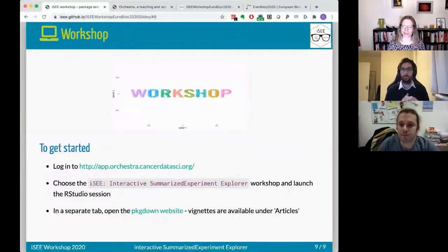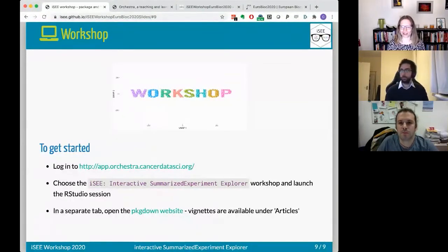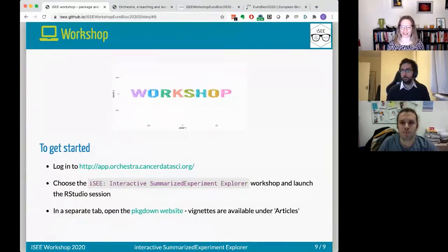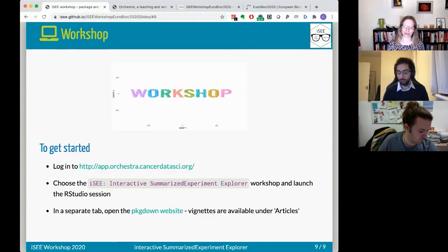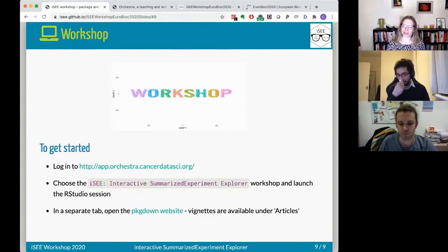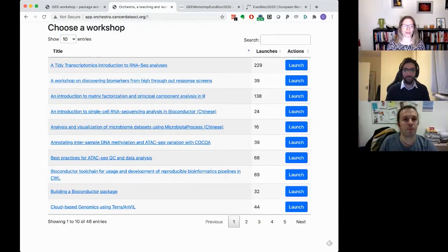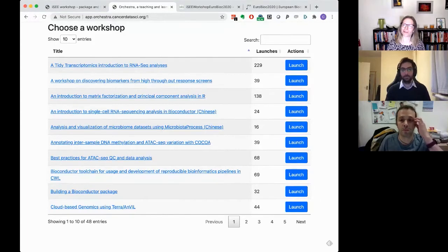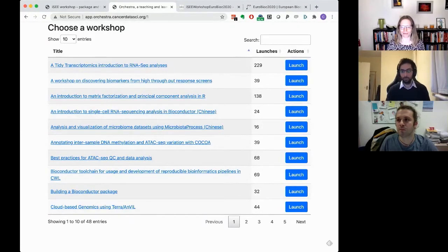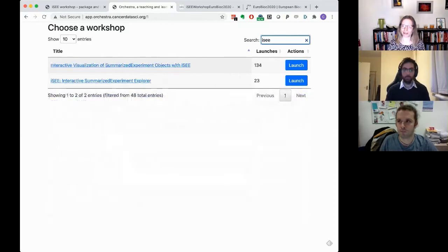We really encourage you to follow along — it will make it much more fun and it's by far the easiest to run this workshop in Orchestra on the cloud. The main reason is that the dataset we're going to use is already included in the container. Go to the Orchestra page, log in — you can register or log in with a Google account or email — and search for iSEE, choosing the one called 'iSEE Interactive SummarizedExperiment Explorer'.